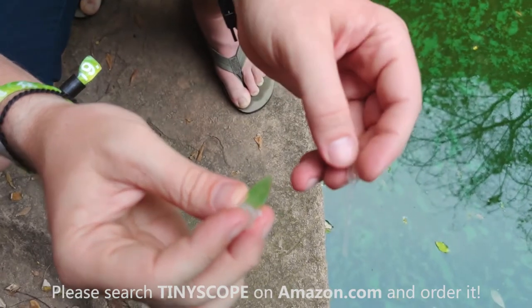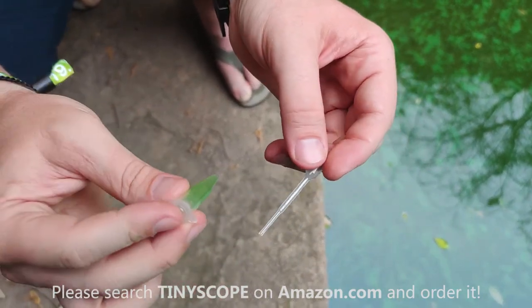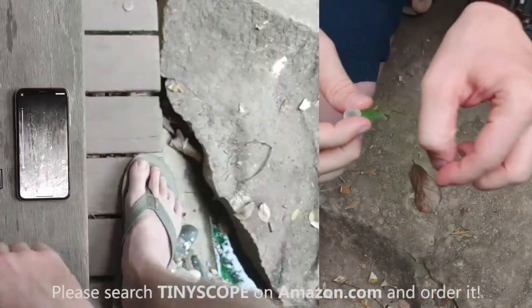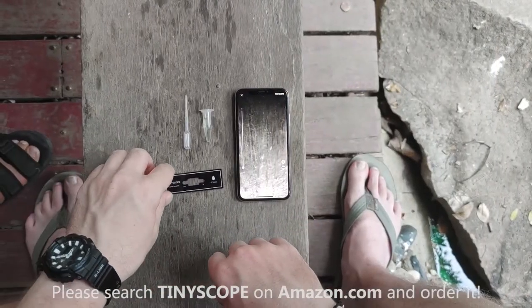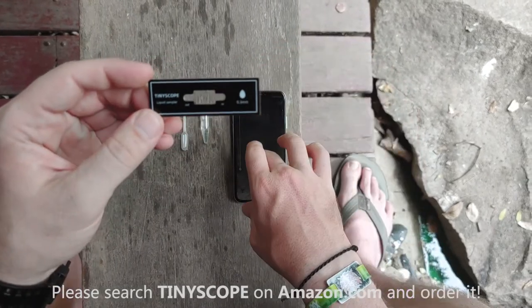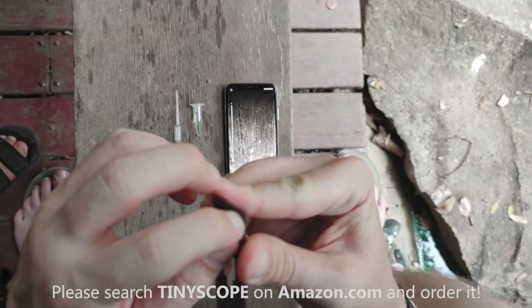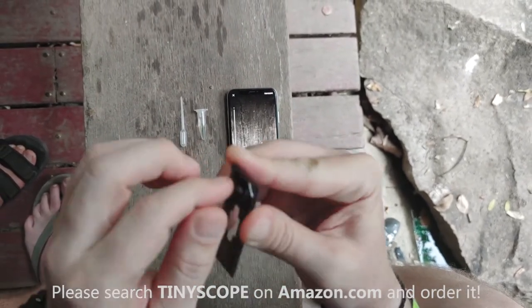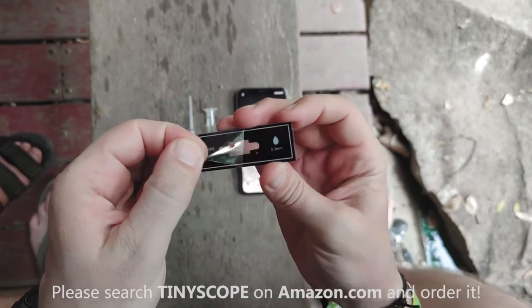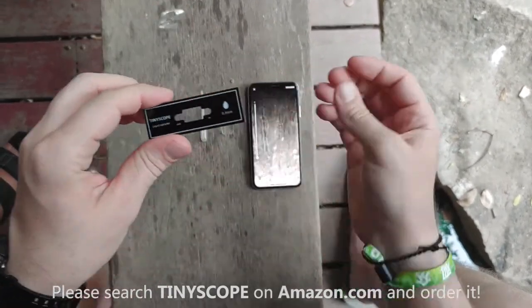Close the top on the sample holder and now you can put it in your pocket and take it hiking, bring it back home, or take it back to the classroom if you're using this at school. Now let's prepare the slide. Right here we've got the Tiny Scope liquid sampler slide. When you get it ready, make sure you take off the protective plastic coating first — there it is, get that off.